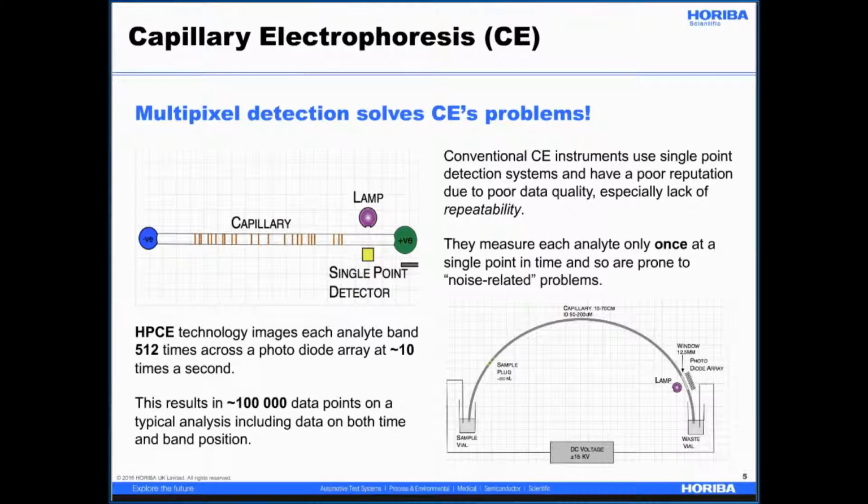This generally results in at least a 10-fold improvement in signal-to-noise compared to a single pixel. This is because noise is dependent on the number of photons collected during the experiment. Splitting the detector up into 512 pixels means that we can keep resolution whilst increasing our detection area, hence increasing sensitivity.